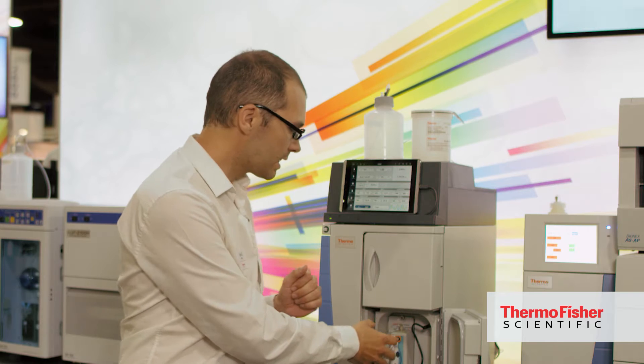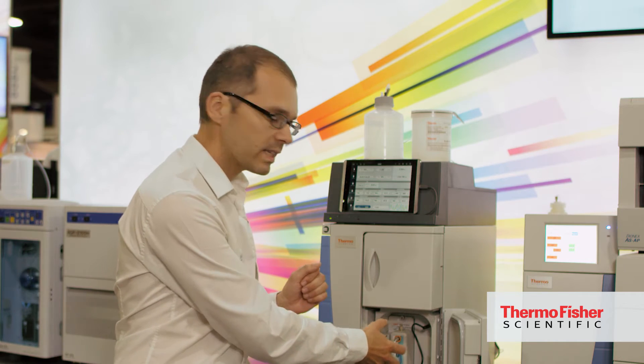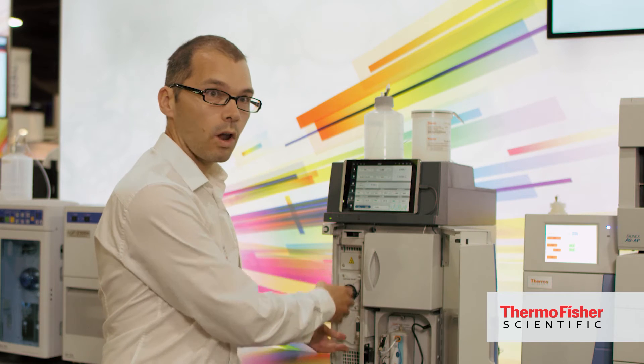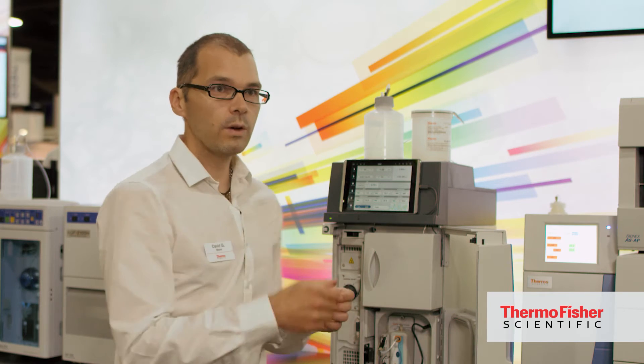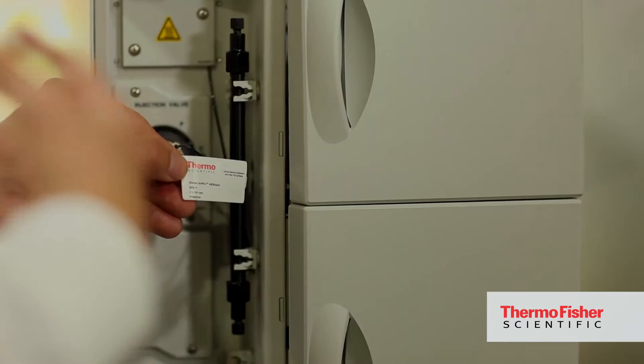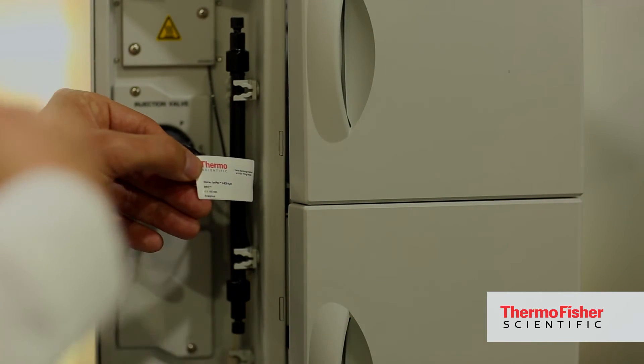We have consumables that are plugged in directly, like the suppressor here. But if we go into some of the other compartments where the columns would be, for example, those aren't directly plugged into the system. So we have RFID tags on the columns that speak directly to the system. Again, we're writing information directly to the tags, and we can keep an eye on the performance of consumables over time.